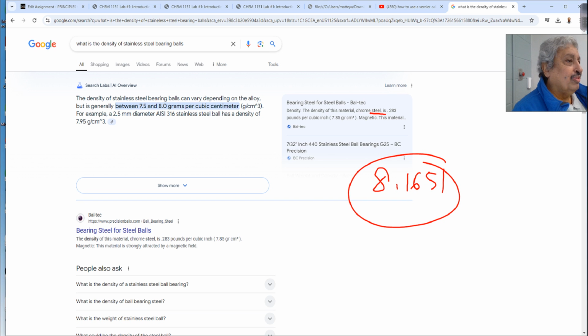Metal, yeah, it's a metal. What type? What's stainless steel here? Why does it give you those two values? Why 7.5? Iron will be oxidized. No, this is iron and what? Carbon. Depending on the carbon, the stainless steel will be hard or just soft.